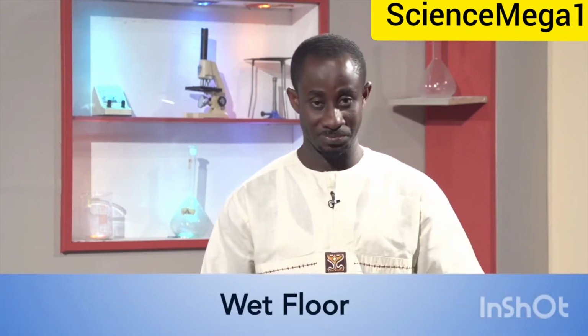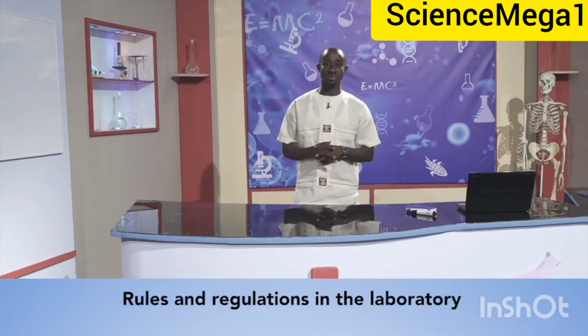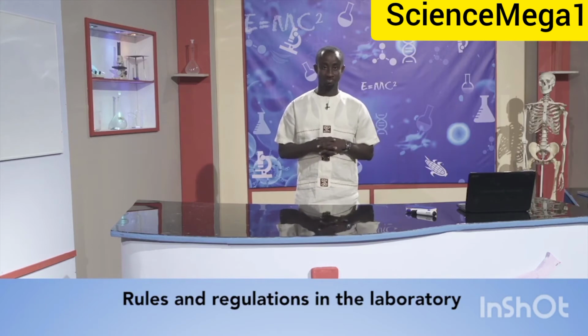Wet floors. Slippery floors have reduced friction and they serve as a hazard because they can cause accidents. Now let's move on to the rules and regulations observed in the lab.